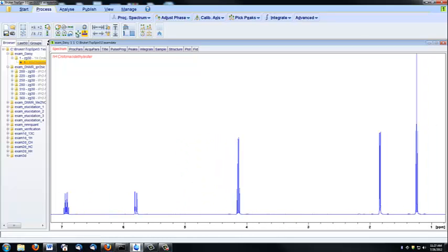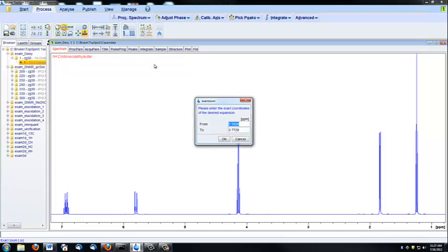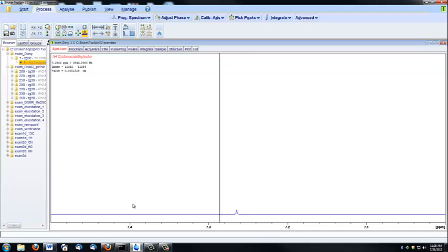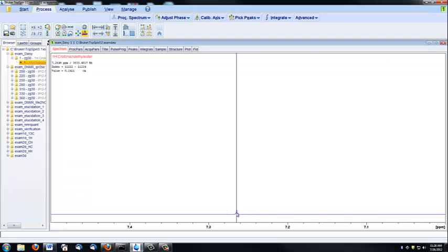If you know an exact region you want to zoom in on, you can click this PPM button and select a certain region. For example, if I want to identify the chloroform peak, which I know falls at 7.27, I can set my range from 7.5 to 7.0, and that will zoom directly in on that region. You can see right here we have chloroform.